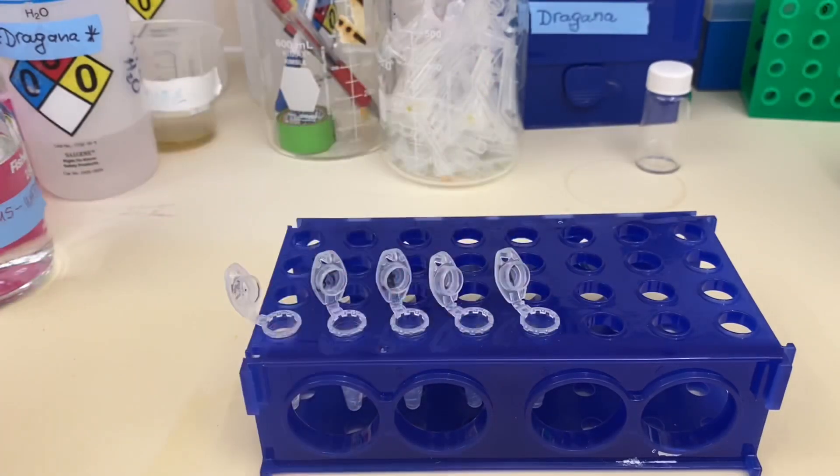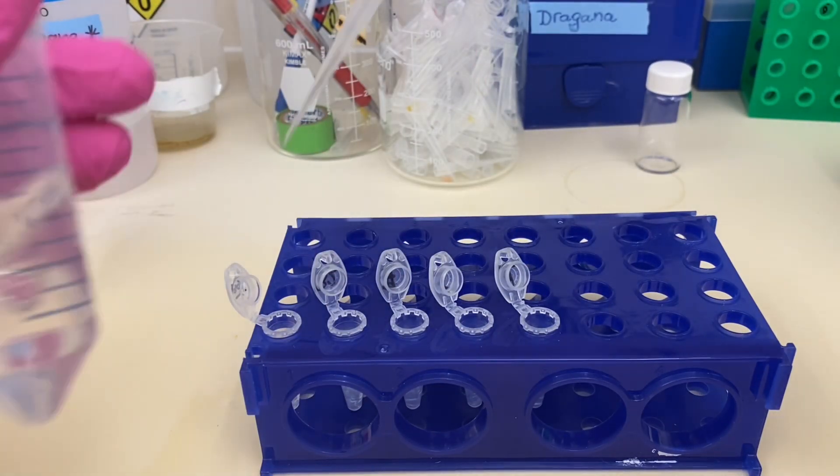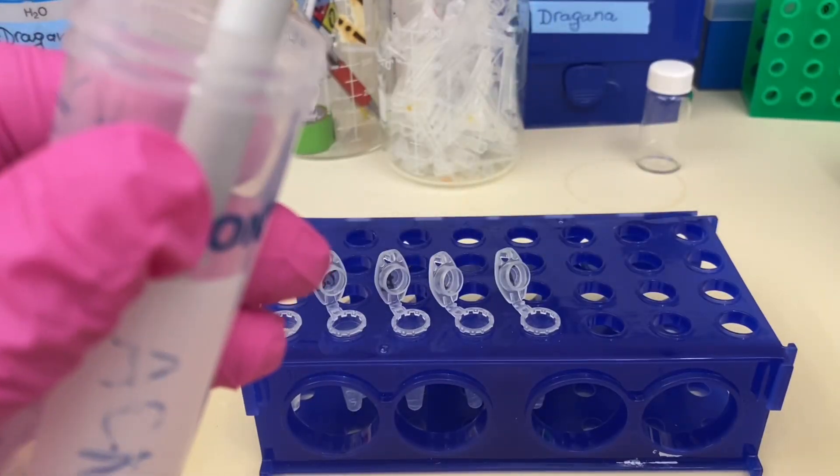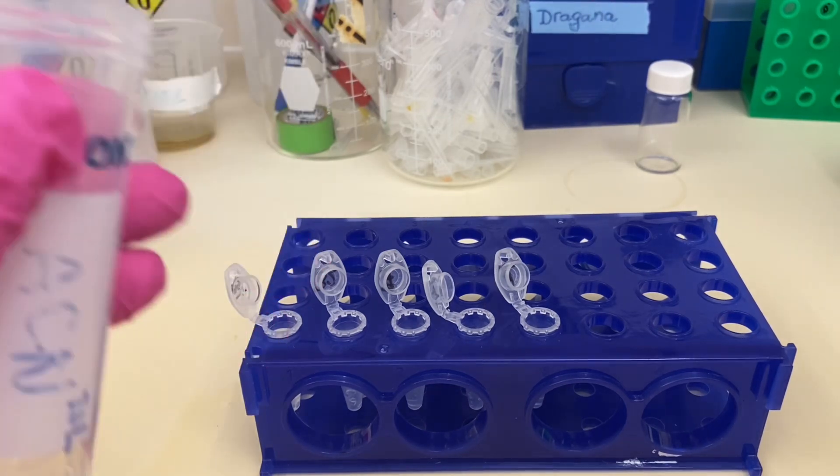After the alkylation step is over, I'm going to remove the liquid from the tubes, I'm going to add ACN, wait for 5 to 10 minutes and then I'm going to remove it.